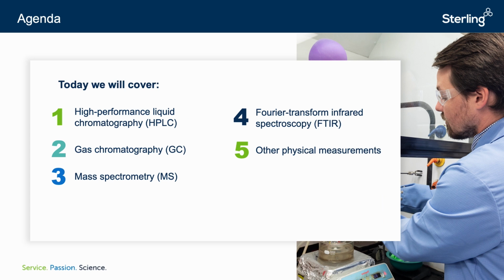Today we will discuss high-performance liquid chromatography, gas chromatography, and mass spectrometry. We'll also take a look at Fourier-transform infrared spectroscopy and other physical measurements.